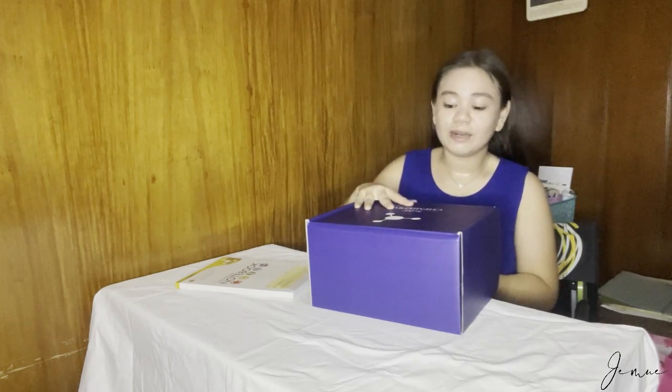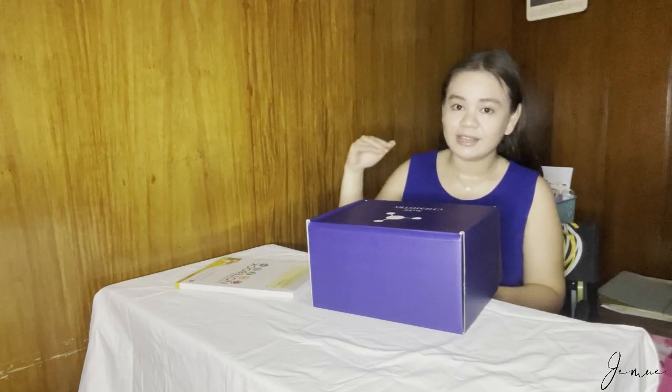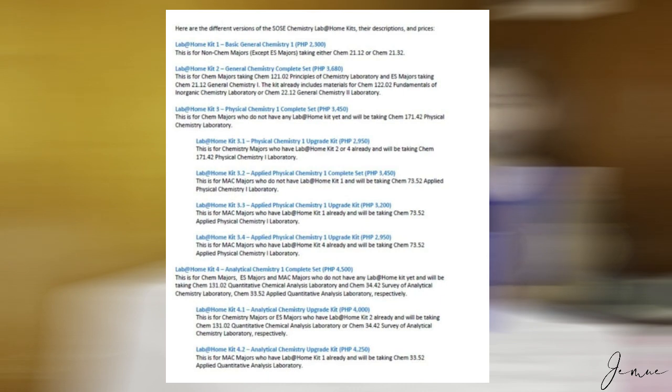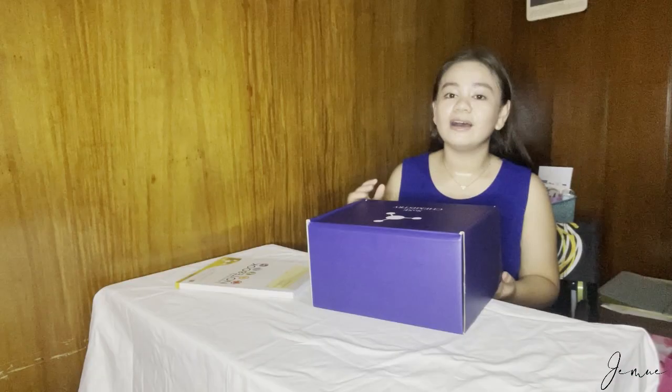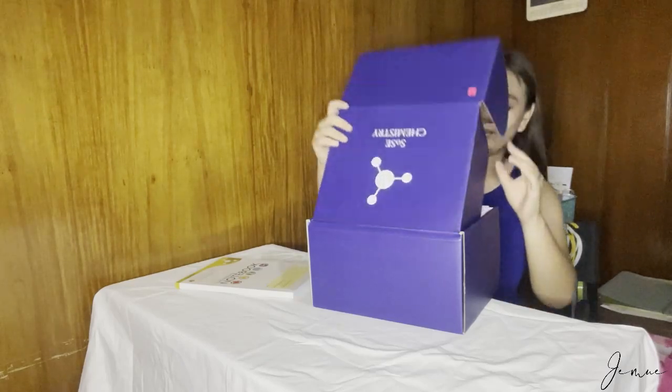First time pa lang namin na mag-try ng chemistry. And I will show you guys the list in here. Nandiyan na din yung price kung magkano. But if you have a scholarship, covered naman nila lahat — pati shipping.